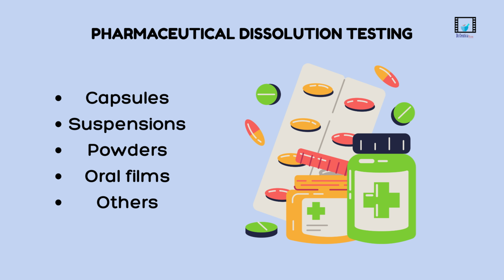And remember, it's not only tablets that undergo dissolution testing. Capsules, suspensions, powders, oral films, and other dosage forms all can be evaluated to understand how efficiently the drug leaves its formulation and becomes ready for absorption.